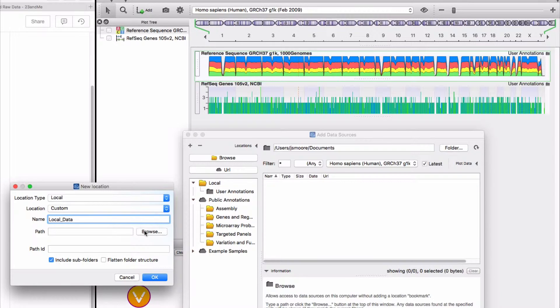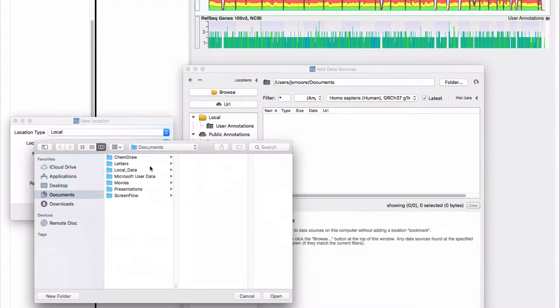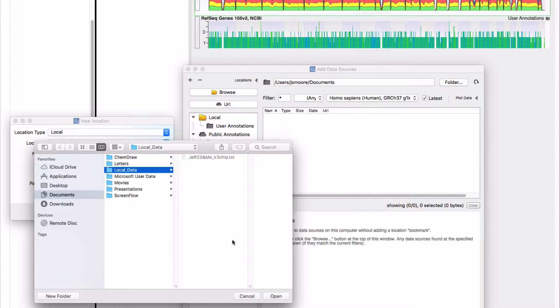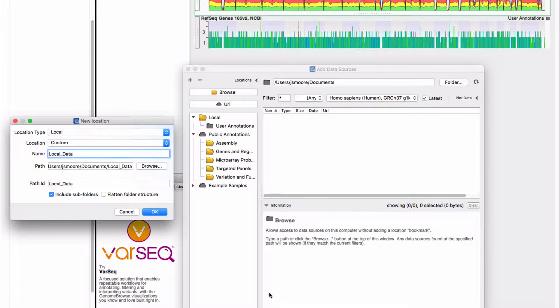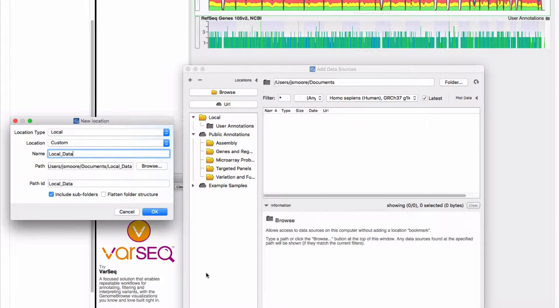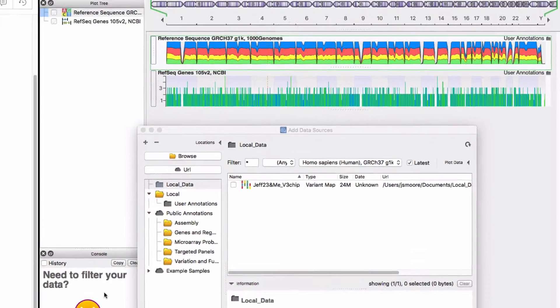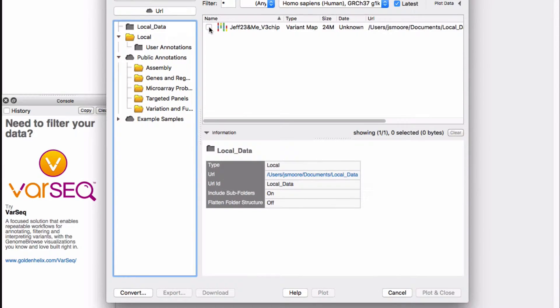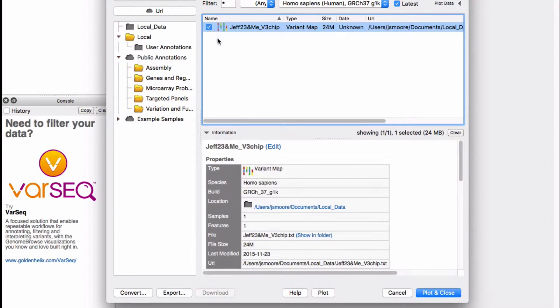Click on browse to find the local data folder on your computer. Click OK and a bookmark to this folder appears in the add data sources window. There you will find your 23andMe data.